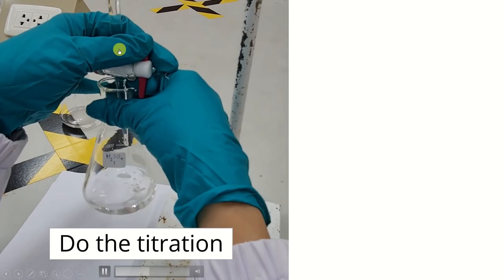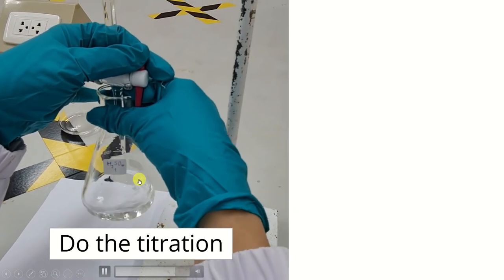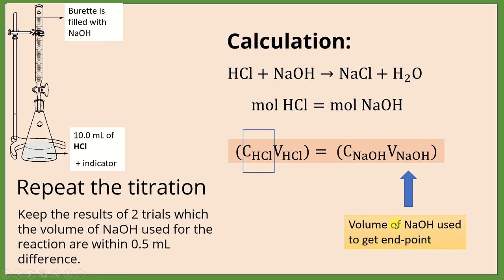See, both hands are needed. One controls the stopcock, one keeps the flask swirling all the time until you get the end point as pink color here. When you are done, do the calculation part.